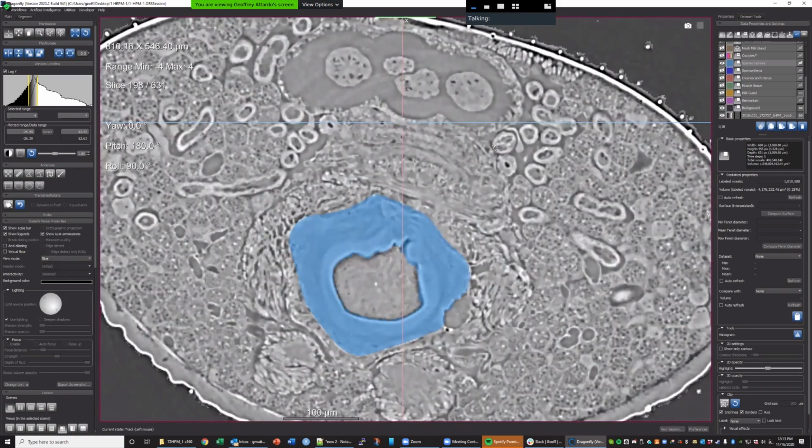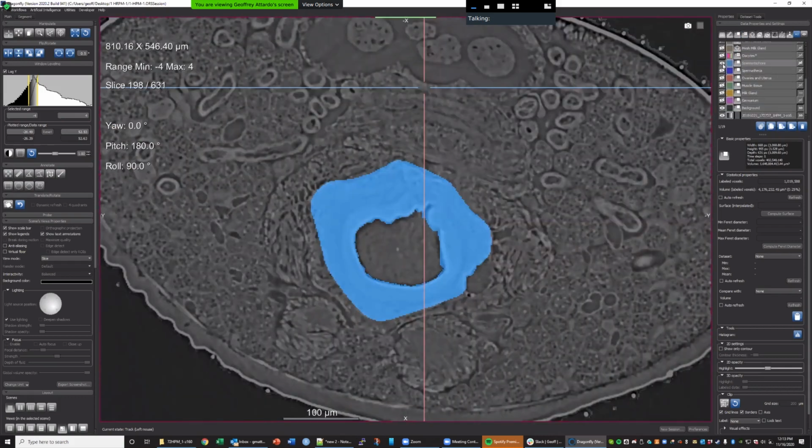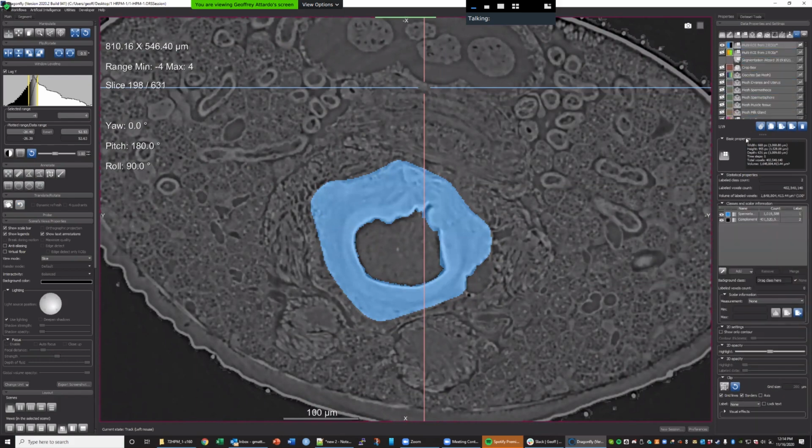Okay, let's try this. So you create a dense multi-ROI from this. Yeah, you probably need to rename it, so in the wizard we know what it is.